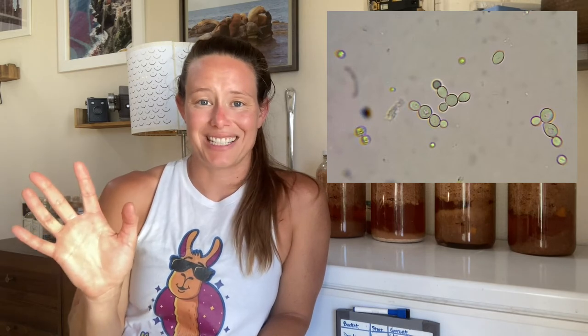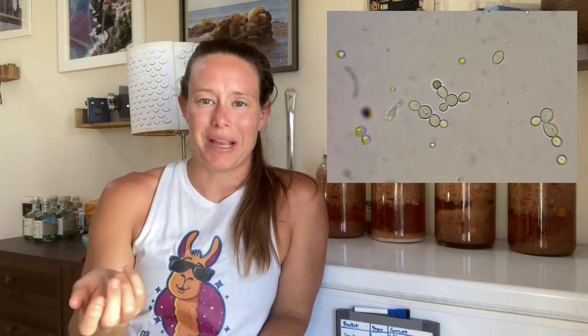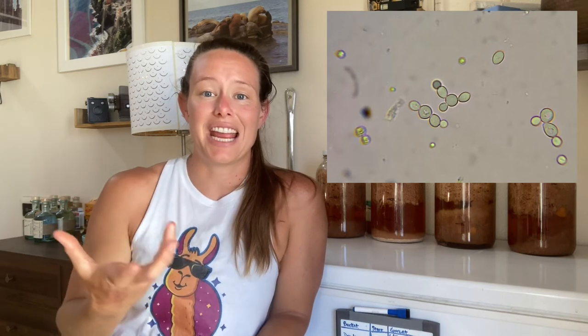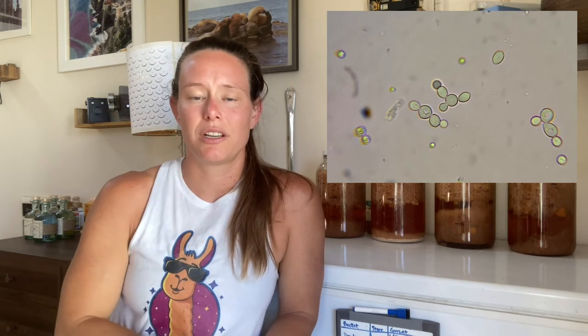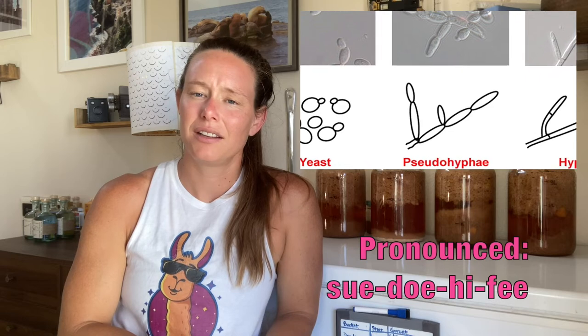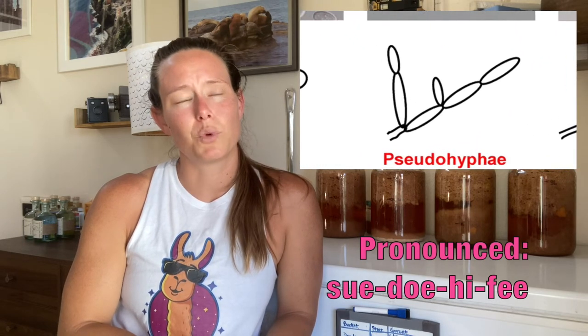Let's hop over to the K1V-1116. There was way less bacteria observed, and that makes sense because again, it started fermenting almost instantaneously, which means it doesn't really give other microbes the time to grow in the environment. It kind of takes over. And this was also circular in shape, but I noticed a lot more of these branched yeast cells. What do they call those? Pseudohyphae, I think. Some pseudohyphae, branched pseudohyphae.